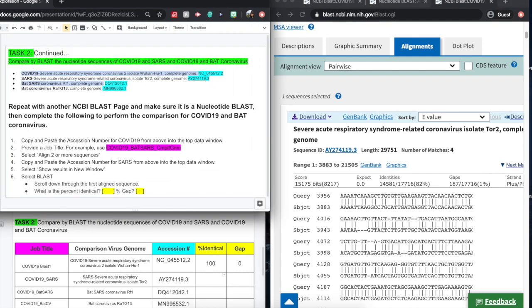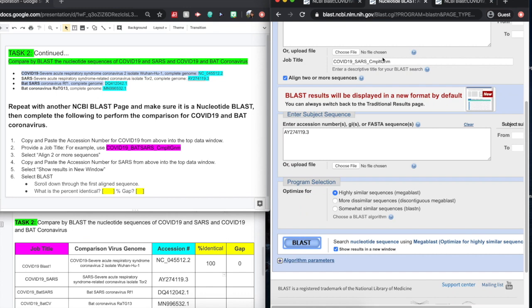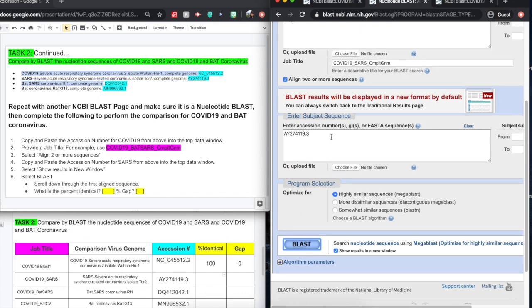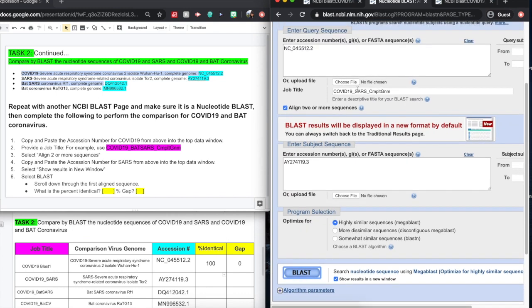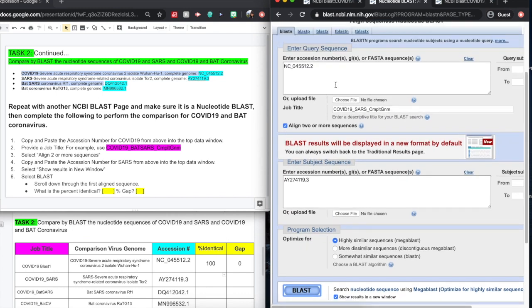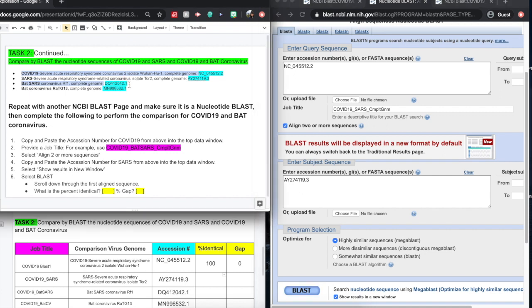The next step is to look at the comparison between the COVID-19 and the BAT SARS. So we've already had this new window opened up. This one's all ready for us, ready to go. We have our original accession number already put into the box. We're just going to scoop up the BAT SARS accession number.